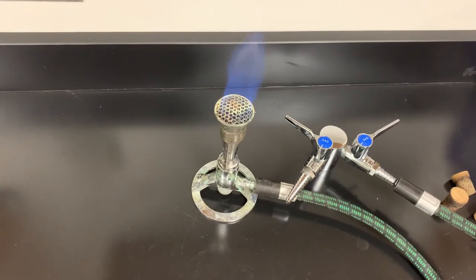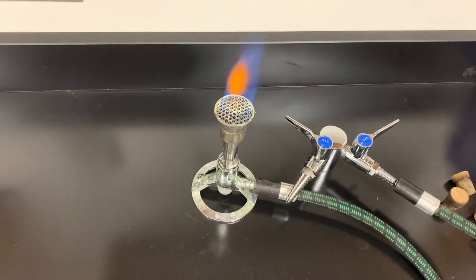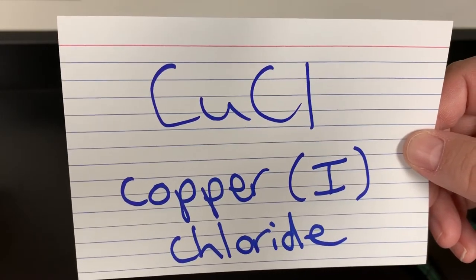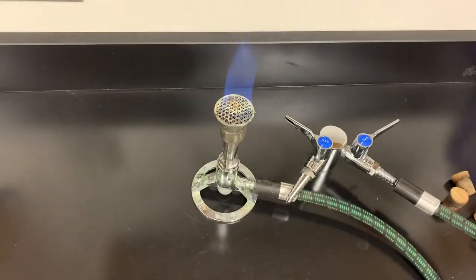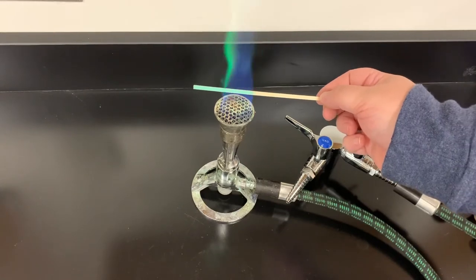That will be it for video number one — go ahead, pause, get your stuff situated, and we'll come back and do the last six. Welcome to part two of the flame test lab. Our next compound is copper(I) chloride. Make sure you illustrate that you've got the copper one — this is different than the other one we did. Copper(I) chloride goes in, and we get a nice green color.